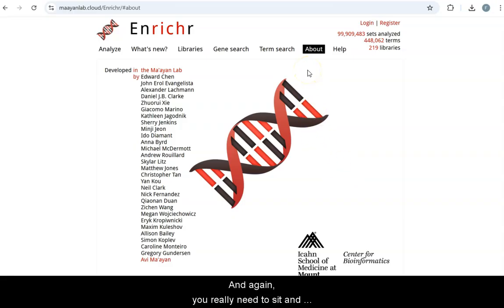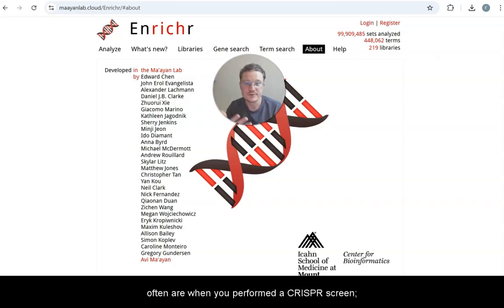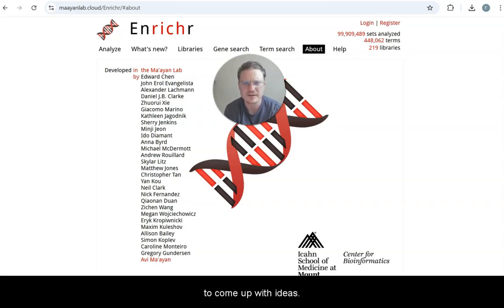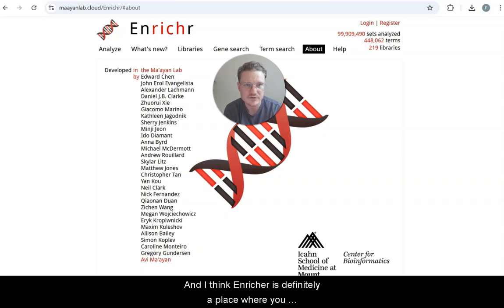And again, you really need to sit and click through these things. But I think especially when you're in a situation like you often are when you perform a CRISPR screen, you have a set of genes and you're trying to understand them, then I think it's a good approach to click through a lot of different tools and come up with ideas. Oh, is there a link to mitochondria? Is there a link to X, Y, Z? And I think Enrichr is definitely a place where you can spend several hours with your gene set.